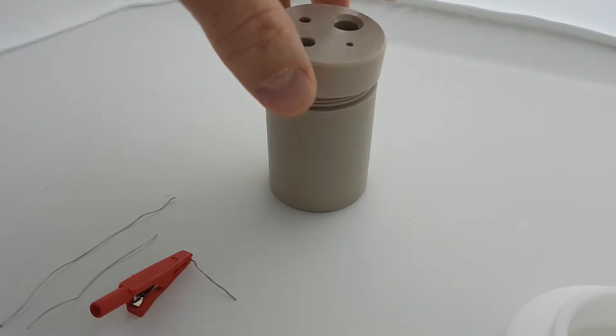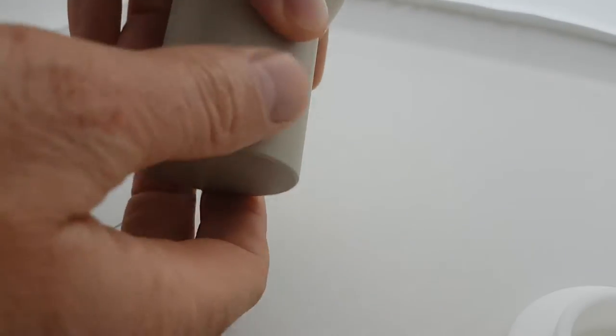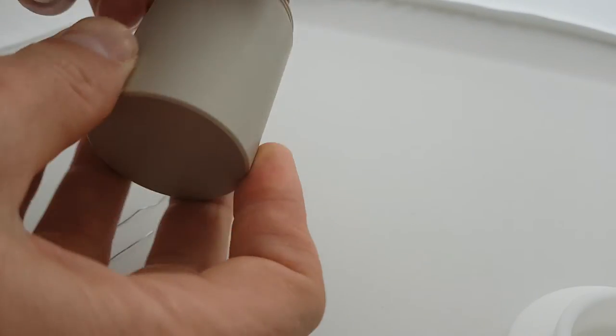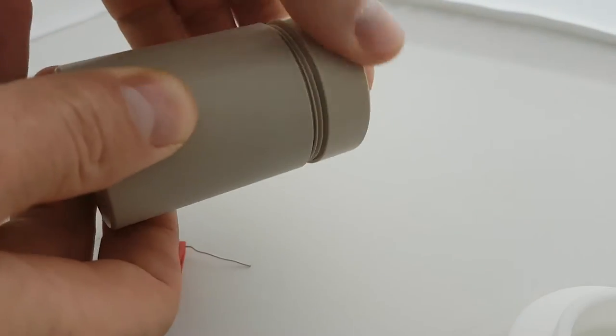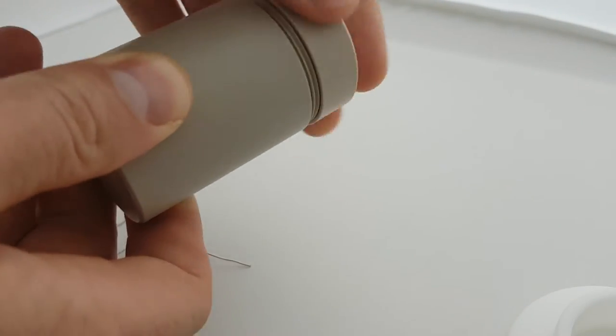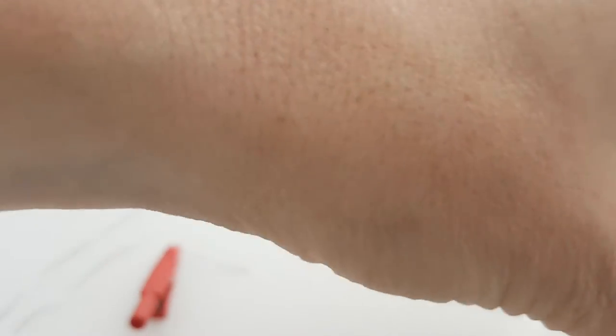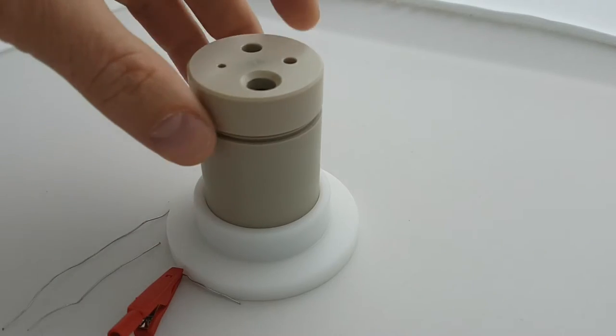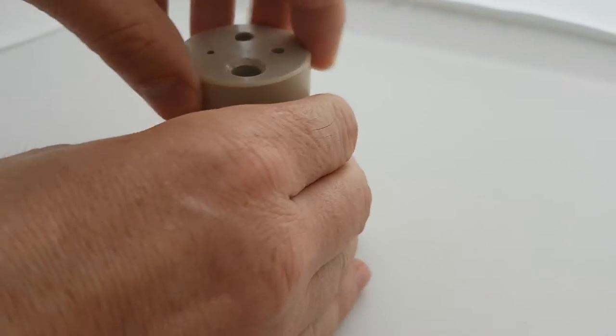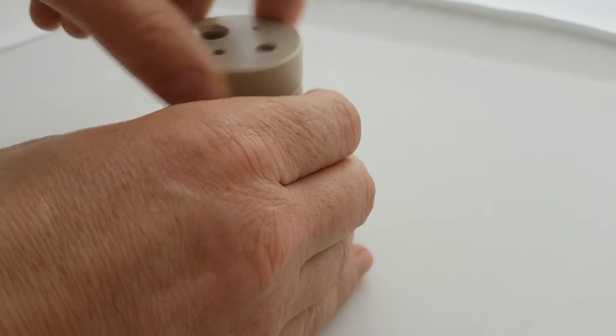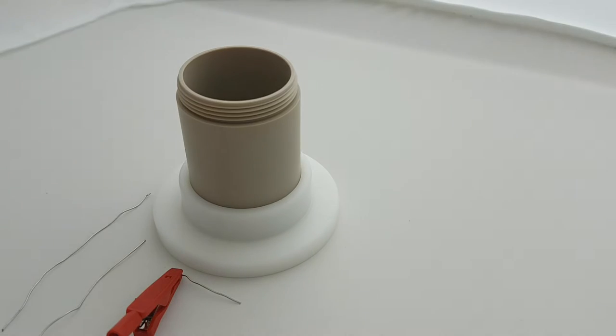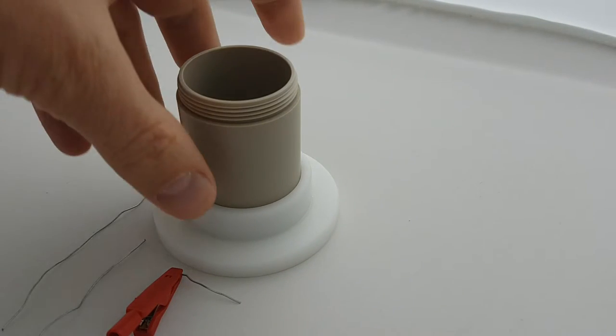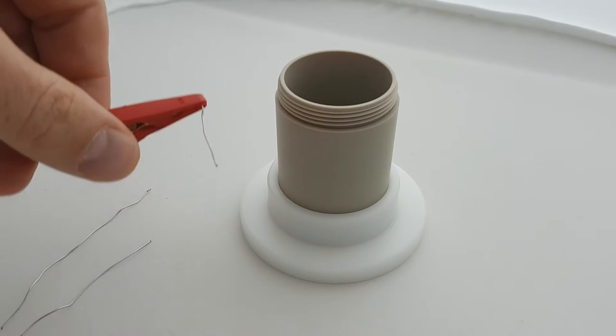So the Electro-Endological Cell has a lid that can be screwed on it. It actually has a holder that it sits in. I'm just going to take the lid off and talk about using wired or wire electrodes with it.